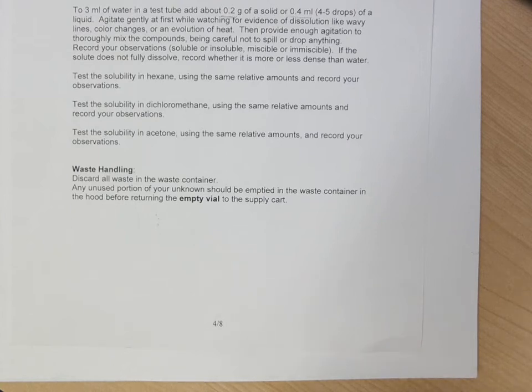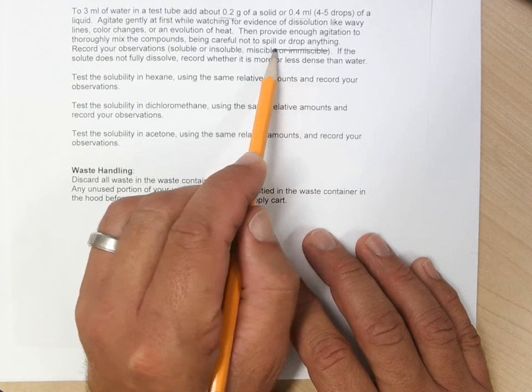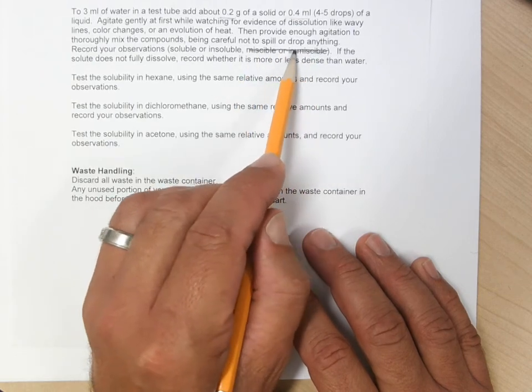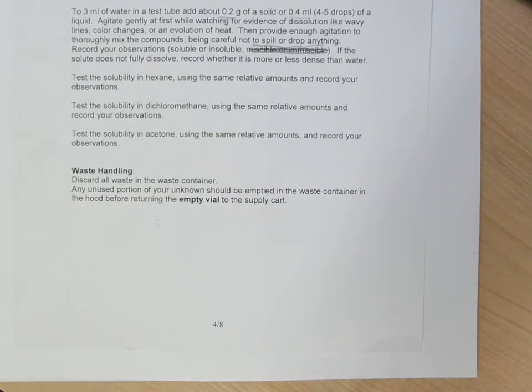Recording physical properties, whether it's soluble or insoluble. And again, this is a throwback; I haven't fixed this yet, but some people say you should use the word miscible or immiscible, but unless you try to dissolve it in all proportions, which we're not doing here, the word miscible is not relevant. So at some point I might actually fix this document.